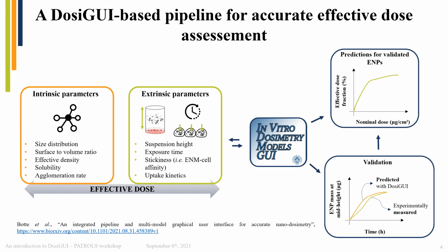So we will see how we validated DosiGUI predictions for 3 commonly used engineered nanoparticles, and how we identified the empirical constants which describe the absorption kinetics of such engineered nanoparticles onto a specific cell phenotype. But before this, let's have a practical session on the utilization of DosiGUI.